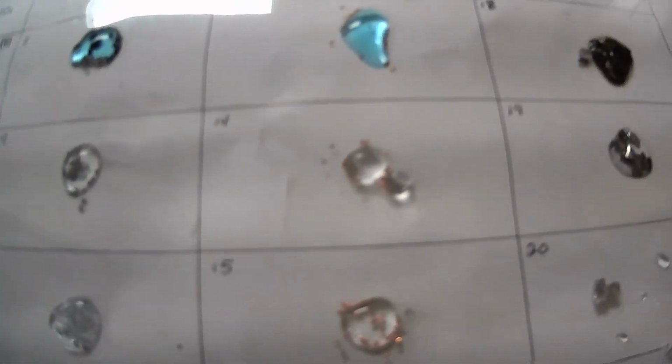All right, then we have the magnesium nitrate with each of our metals. So this is the magnesium nitrate and the zinc. Nothing has occurred for that one. The copper, again, nothing has occurred, so no reaction there. And then the magnesium and the magnesium nitrate, again, no reaction there. It's a little bit difficult to see, but trust me, I still see the shiny silver there.